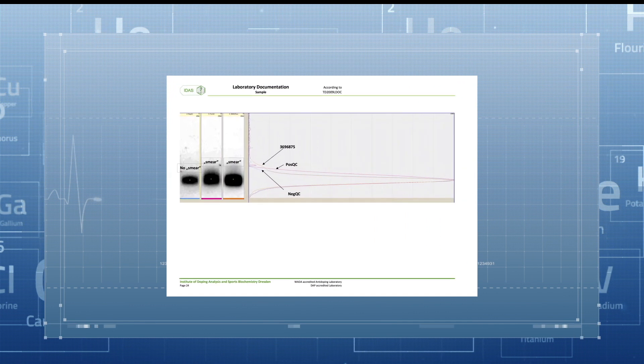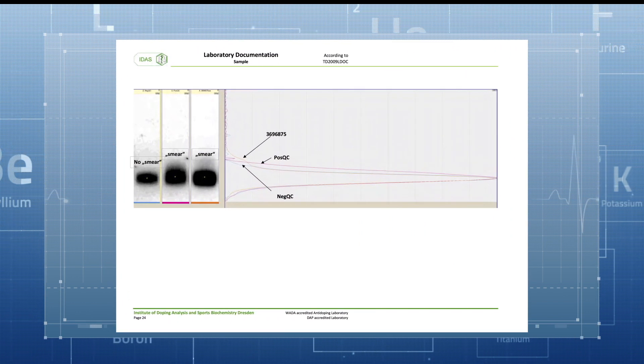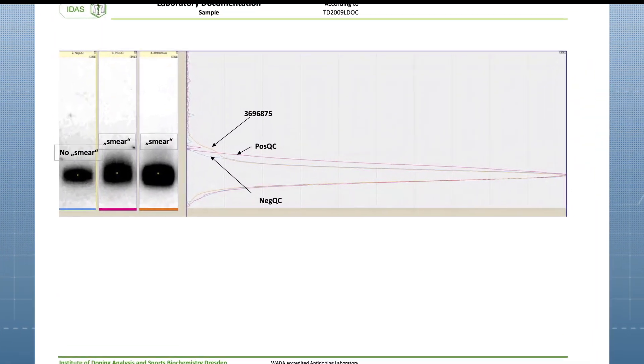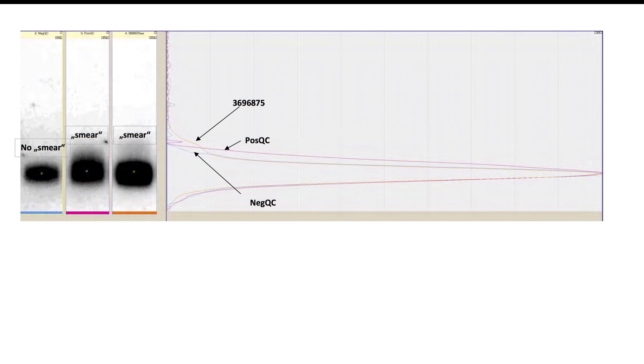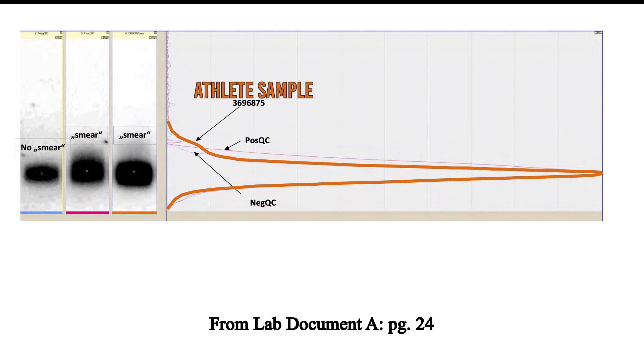The laboratory used software to visualize these results with a line graph. In order to identify a specific protein, the sample must align with the positive control. Here is the athlete sample. Here is a positive control. There is obvious variation on the relevant upper half.